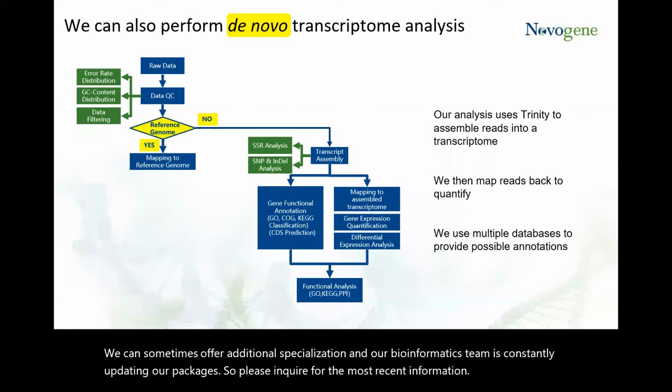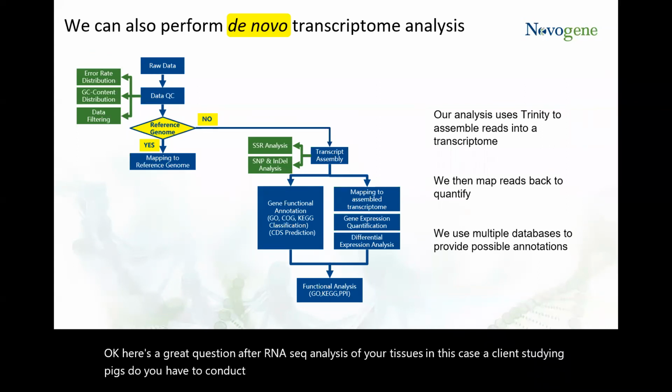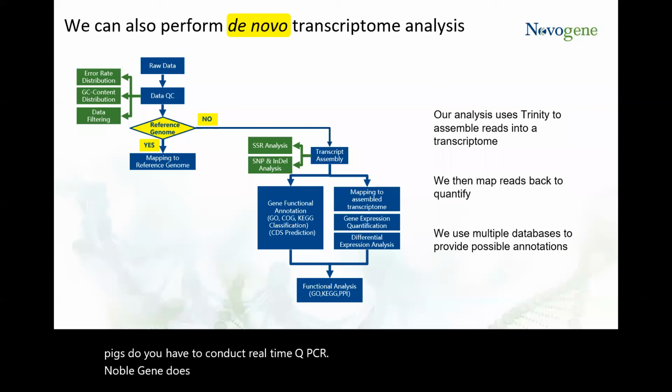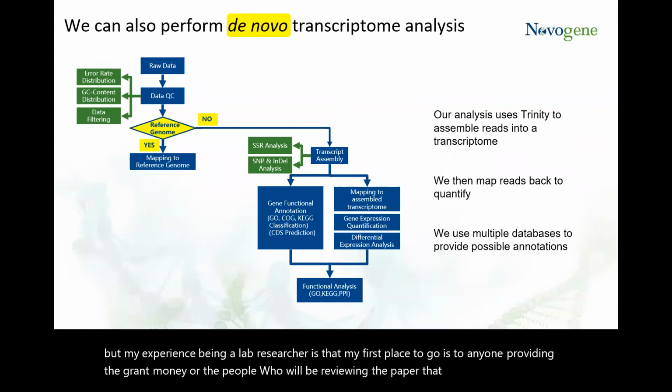Okay, here's a great question. After RNA-seq analysis of your tissues, in this case, a client studying pigs, do you have to conduct real-time qPCR? Novogene does not tell you what you have to do. We are here to support your experiment. But my experience being a lab researcher is that my first place to go is to anyone providing the grant money or the people who will be reviewing the paper that I need to submit.